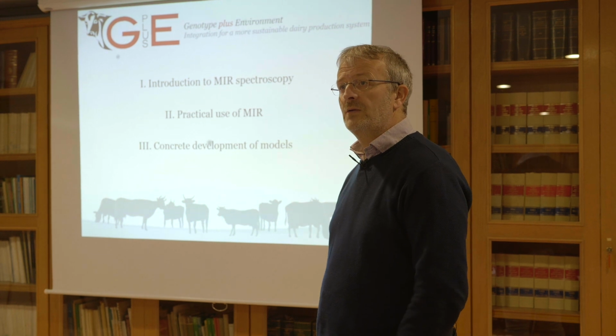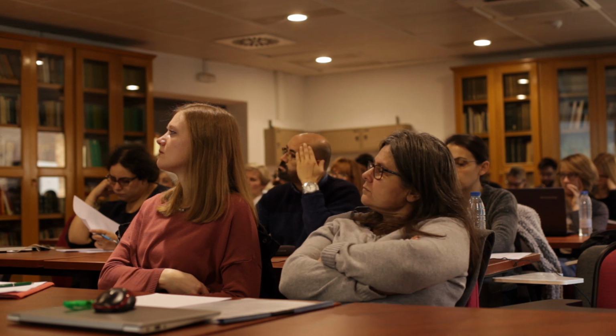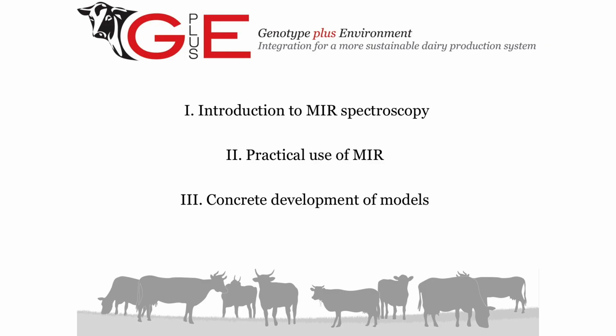My presentation will be in 3 parts. First of all, I will make a small introduction to the mid-infrared spectroscopy. After that, I will focus on some practical use of mid-infrared and some topics very important to know. And I will finish by giving you a concrete development of models that we have developed in the GplusE project.